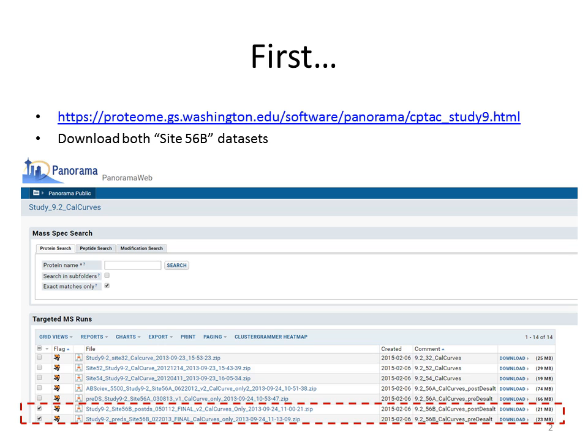Okay. So I had sent an email last night. This is a link from the study I discussed earlier this morning, where it's looking at fully Skyline processed or integrated data files from the experiment that has light C13 N15 synthetic peptides and fully labeled N15 peptides present in the sample. And you can download either of them, but the examples that I am working from will be the post-DS. DS is for desalt, so peptides were added in post-desalt in that experiment.